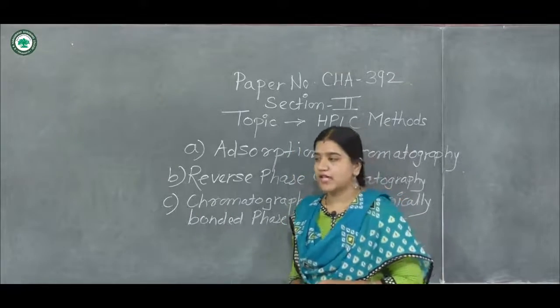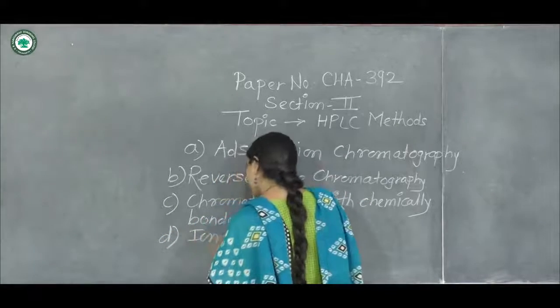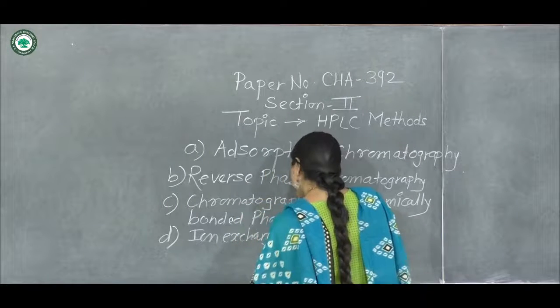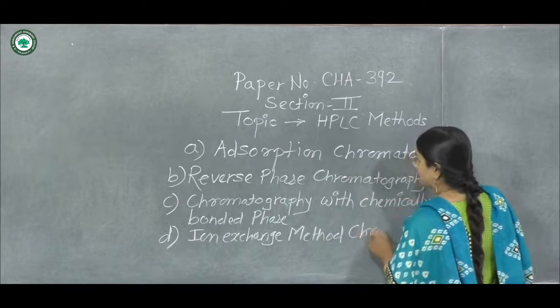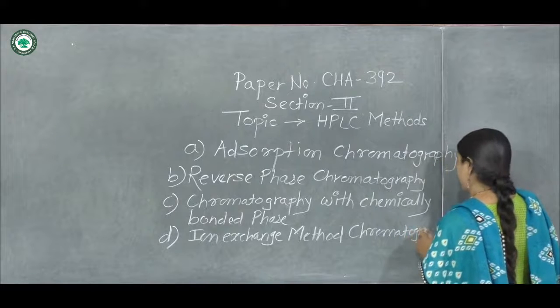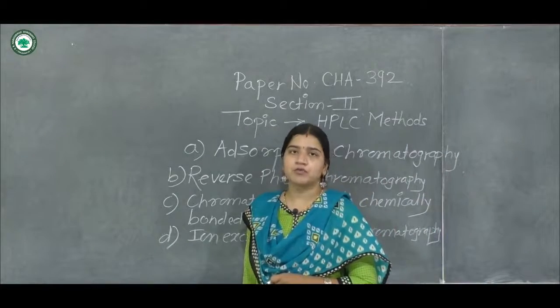Then the fourth one is ion exchange chromatography. And the last one is ion pair chromatography.